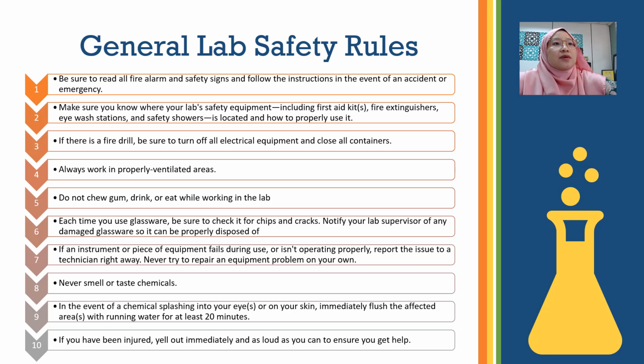In the case of an instrument or piece of equipment failing during use, or if it cannot operate properly, the first thing you need to do is report the issue to the technician right away. Do not try to repair the equipment on your own. Number 8, never smell or taste chemicals. Please do not smell or taste the chemicals.